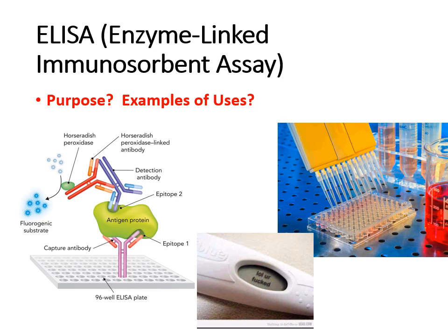It can identify very low level antigenic proteins, and we are able to use it with a lot of different biological samples. The reason why I mentioned microbiology is that ELISA is one of the big methods that we use for diagnostics.